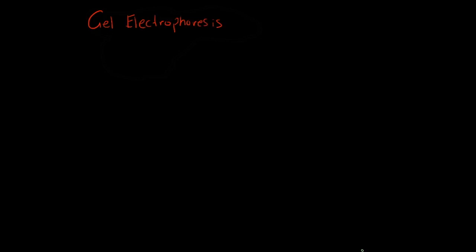I just want to add a few things to the gel electrophoresis video that I just finished. There's a few parameters that I didn't mention that influence the rate of migration of the DNA molecules during gel electrophoresis, and there's also some parameters that don't influence, and I just want to mention a few of those right now. So let's just do a little line here. So a few things that actually do influence it.